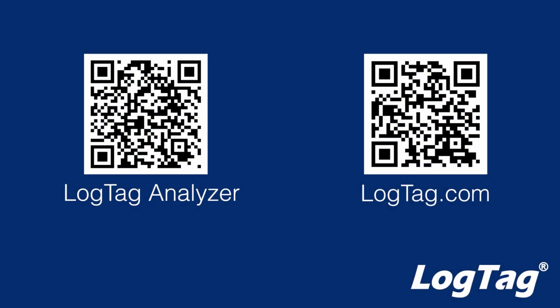For more information, please visit the LogTag website at logtag.com, where you can find resources on setting up and recording with your logger and using LogTag Analyzer for analysis.